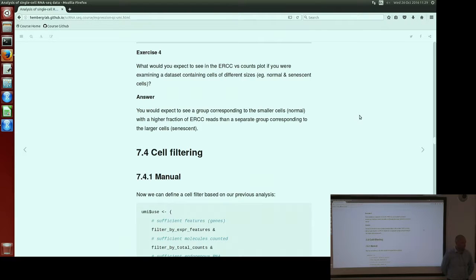And I think we should add here that the way the ERCCs are constructed is that there are 96 of them, and they are constructed in a concentration ladder, spanning about 6 orders of magnitude. So that's why if you only have very few reads going into your ERCCs, you'll only get the few which are at the very top of the ladder, which have the highest concentrations. So you need to have a lot of sequencing reads going onto the ERCCs in order to be able to capture the more lowly expressed ones, which is what you need to be able to do proper normalization.